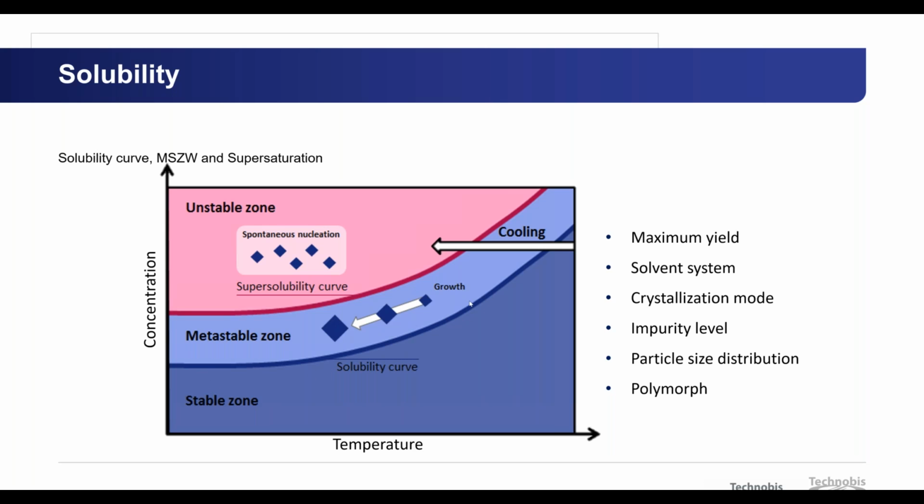And you can imagine, from the same measurement, after you heat your sample and get your clear solution, you start to cool and then you get your points on the supersaturation, the nucleation curve. And implicitly what you have in between is the metastable zone. Quite important to know this if you would like to, for example, define your crystallization process afterwards.